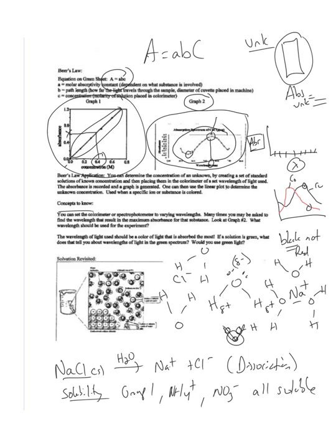Because we're looking at solutions, so substances like copper dissolve in water having ions, and then some of these ions do cause colored solutions where we can use colorimetric analysis in Beer's law. So just a review of this concept. If you have any questions, don't be afraid to shout them out to me, but I just want to review these quick concepts and things you might see, because I can bet both FRQs you have on the national exam will have some type of experimental or lab component to it.